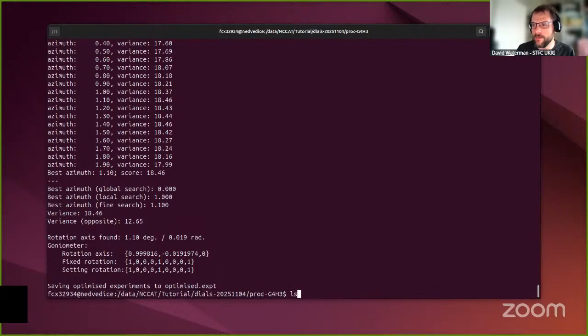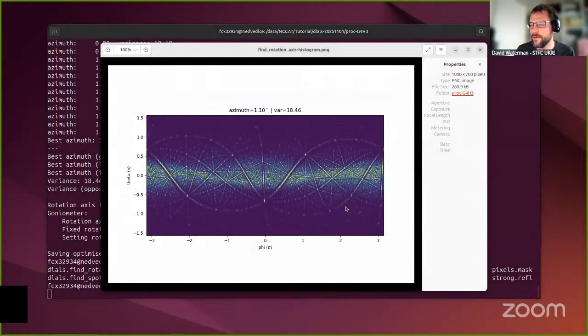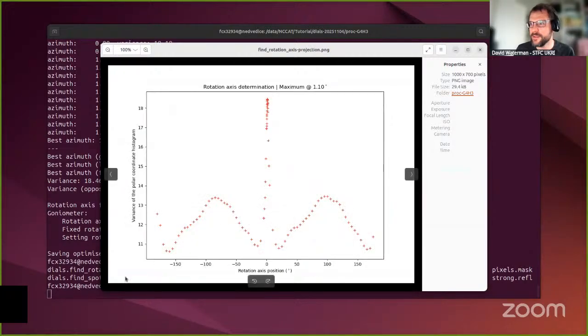But what this program also has done is create 2 image files, which I can open using whatever image viewer you have on your system. If you've got Ubuntu on WSL, then it will also be EOG. We'll open an image, and if I paste the image file name in, you can see that cylindrical projection at the orientation it likes best, and then also this plot.